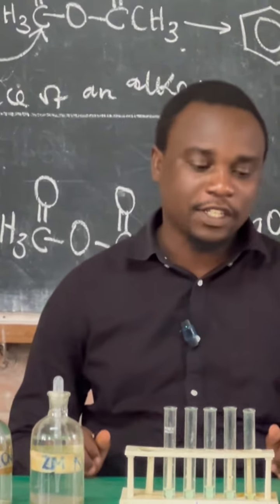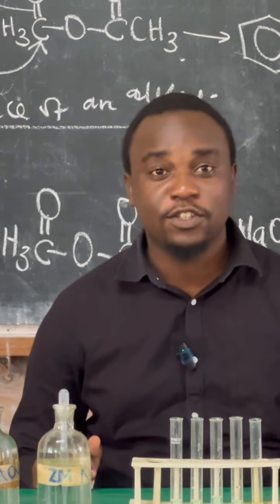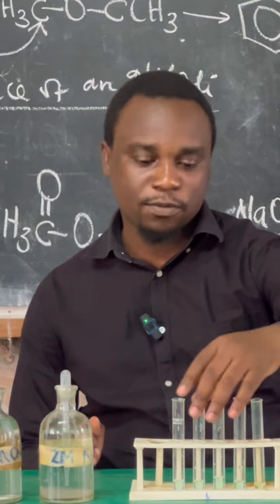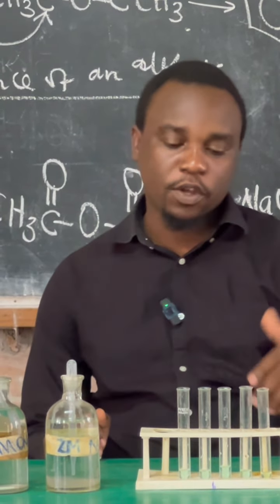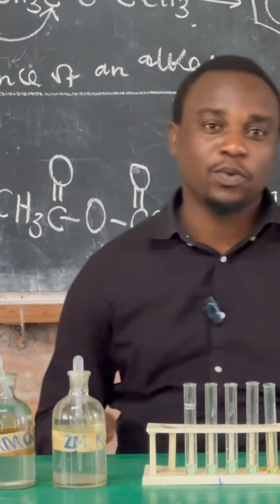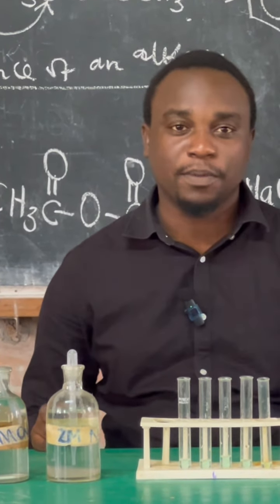Today, we are going to look at testing for copper 2 ions in solution. Here with me, I have test tubes which we presume contain copper 2 ions, and we shall see what takes place when we test for copper 2 ions.